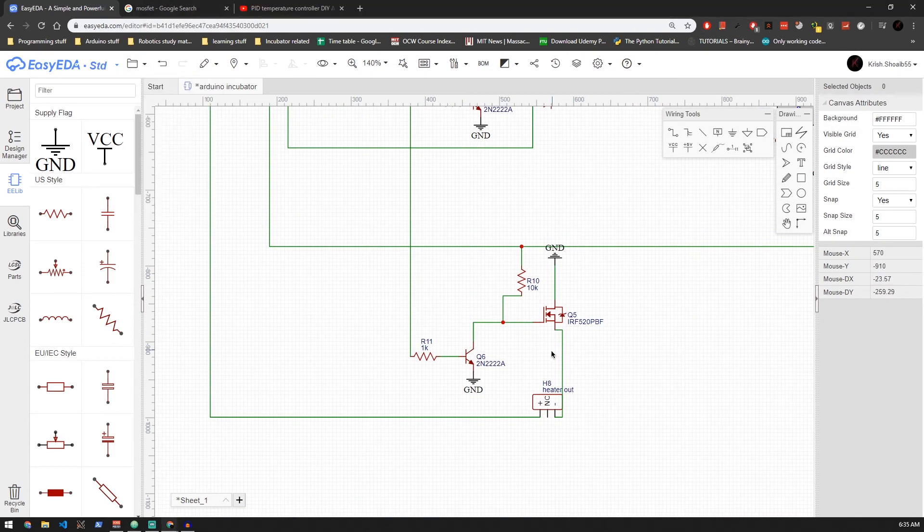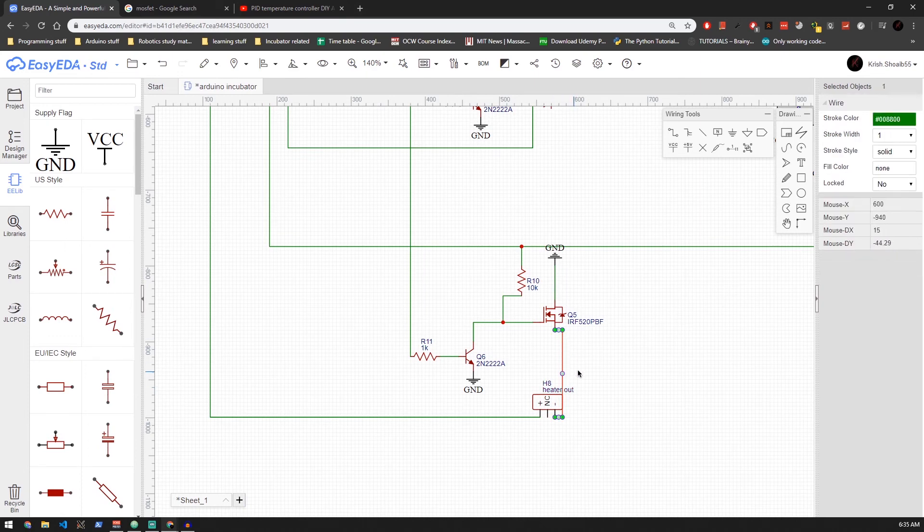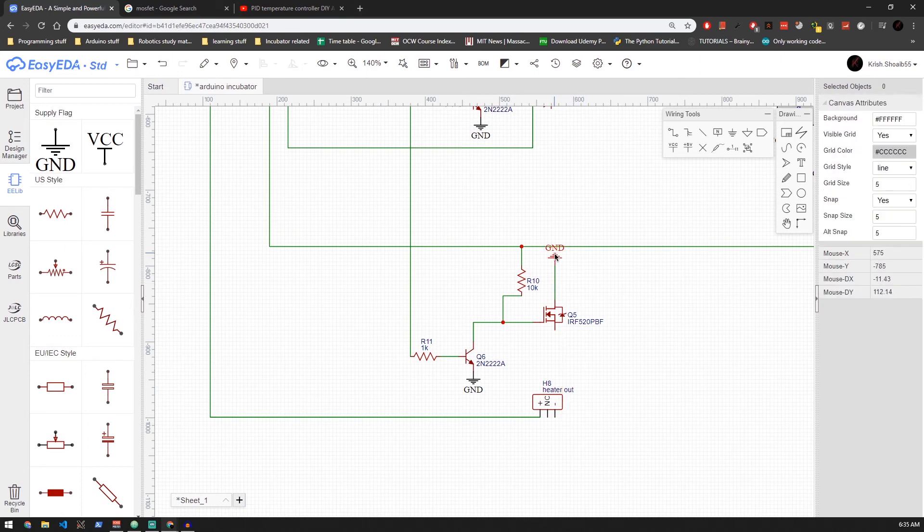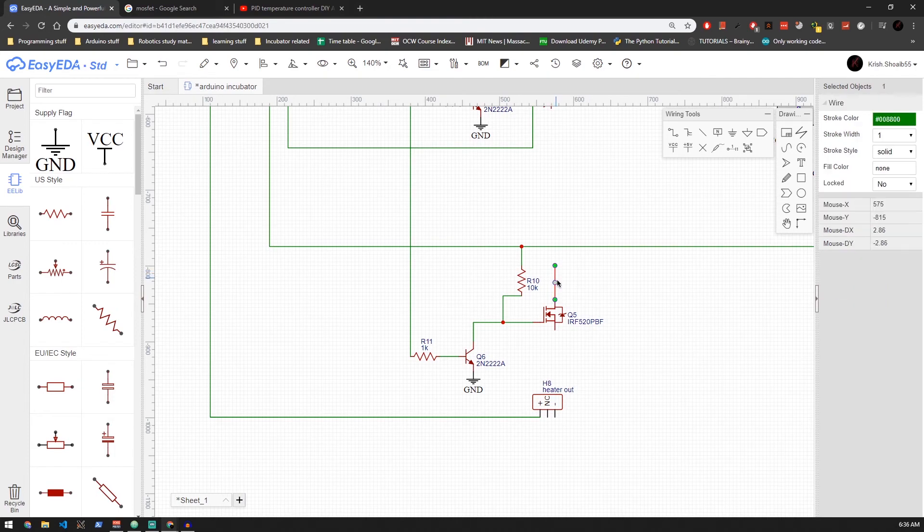I'm also going to be using a transistor in between Arduino and the MOSFET just to be safe. Note again that all the grounds are common in this circuit.